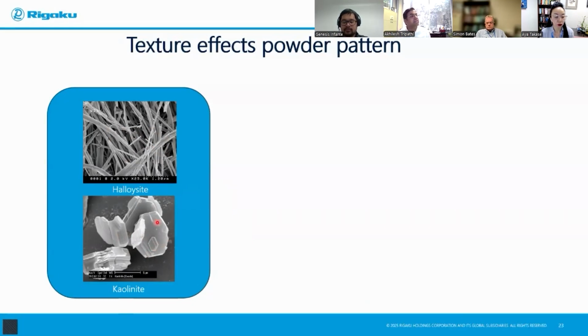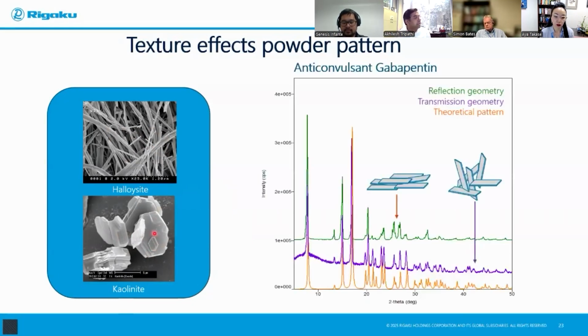What happens in X-ray diffraction, if you do not take care of this, is that the phase which is more visible to X-rays upon diffraction, for example if you put them in reflection mode, is the only one you will see, and you will get preferred orientation. This green peak is raised because, for example, let's say this is the 00L peak, the 004 peak. The 004 peak is enhanced because X-rays are seeing it most of the time. It doesn't see these edges unless you take this into account and use an appropriate geometry or method to circumvent this.